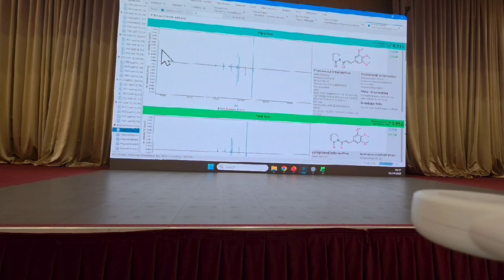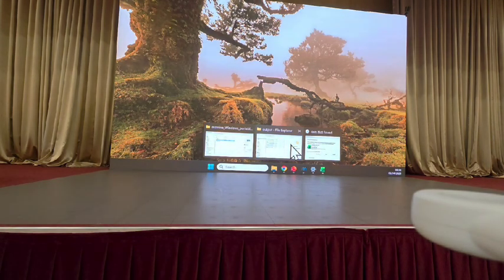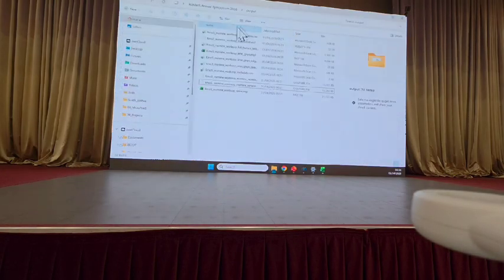With that being said, one last thing I want to show. Before, you set the path in the MZmine wizard, and you now have all your results exported into a single place. And this is really good for later analysis. So let's say you analyzed your samples 3 years ago and you forgot where you put one file. This puts all the files in the same place. So it's really hard to lose.